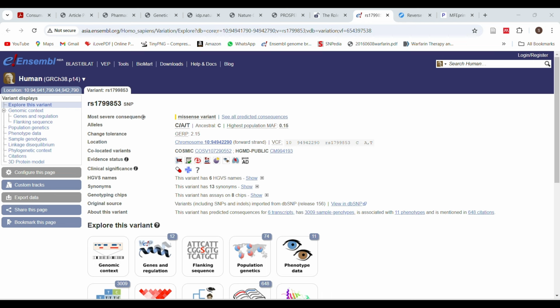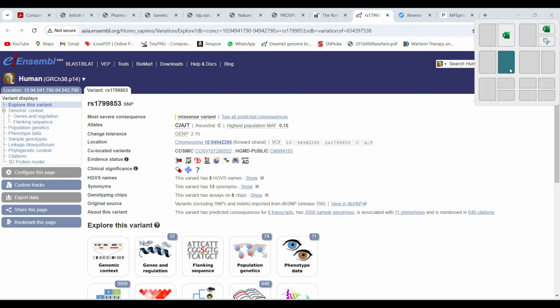So from that output, if you remember, if you have practiced, you must be knowing that we had got some 10 outputs, right? So from those 10 I have selected one to further process my primers, right? So I'll just go there.